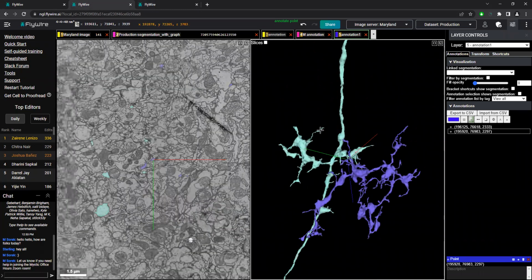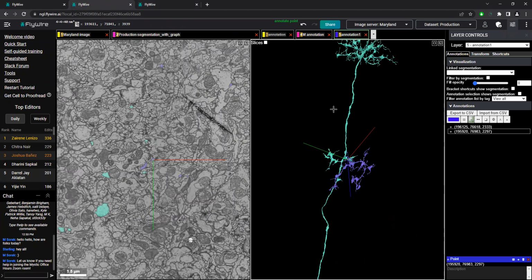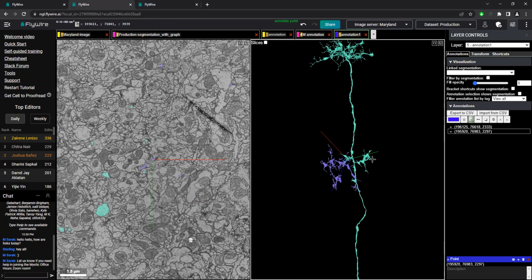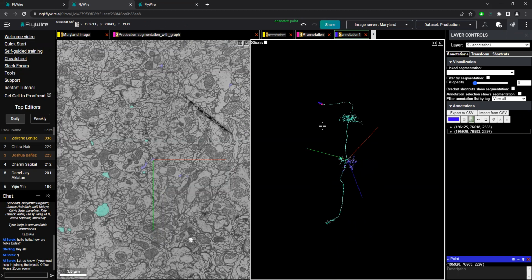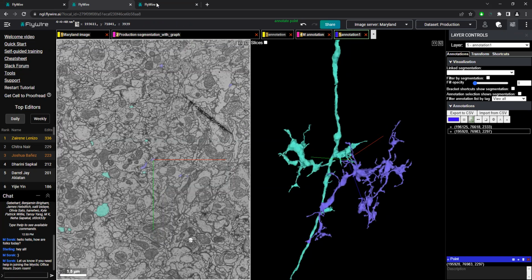And then finally found this little tiny connection over here where it fits in with the rest of the cell. And we know it does because it has a similar structure, with the fine hairy filaments coming off from these thicker boutons, and it also helps to wrap around the central main backbone here, similar to its friend up top. So that is one way to look at it.